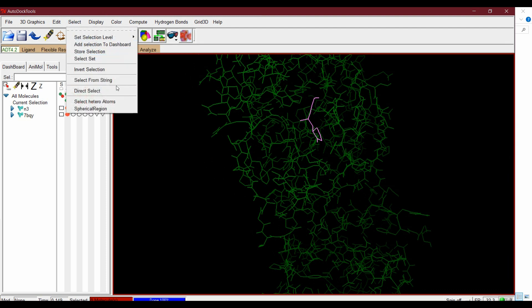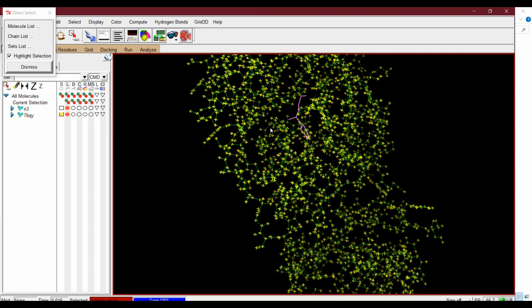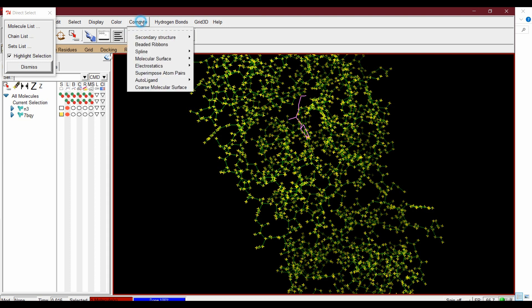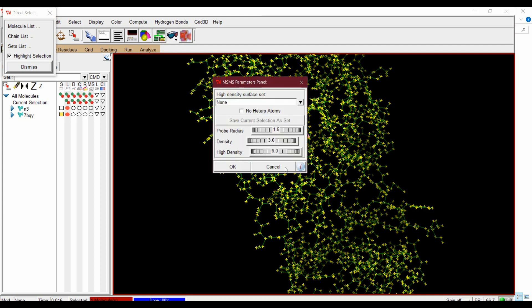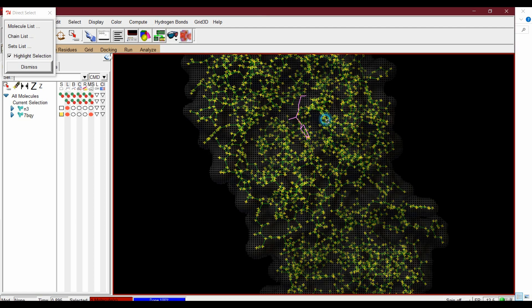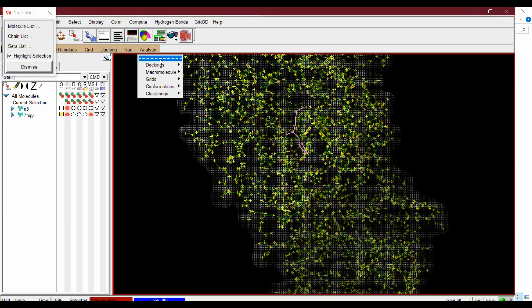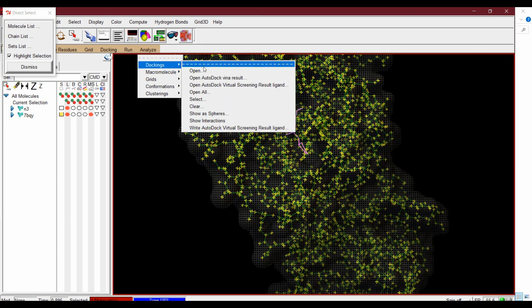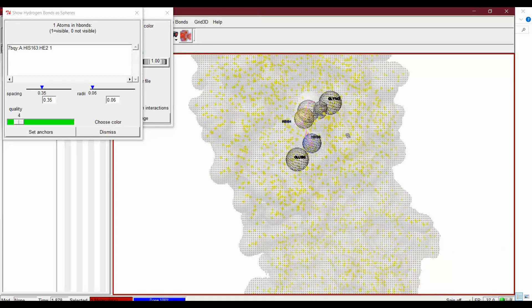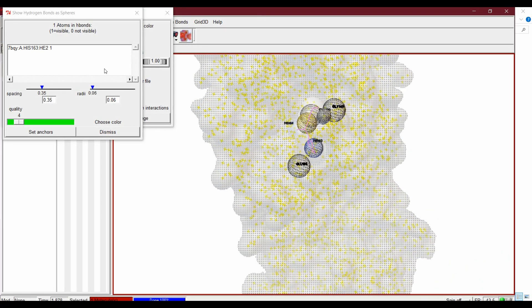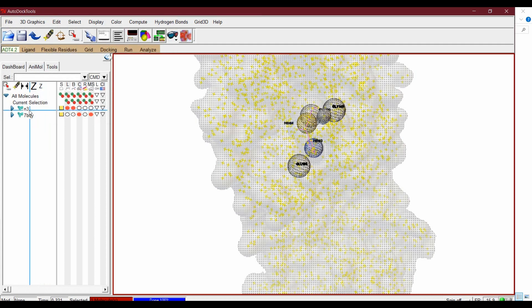From Select > Direct Select, select the macromolecule. From Compute > Molecular Surface, compute the molecular surface. Then from Analyze > Docking > Show Interactions — this will show the interaction of the ligand with the residues.